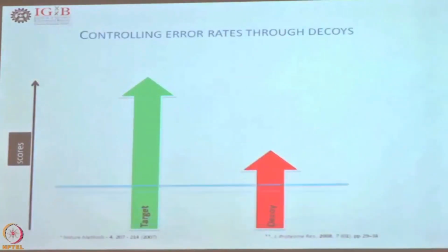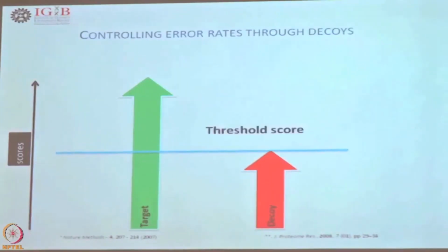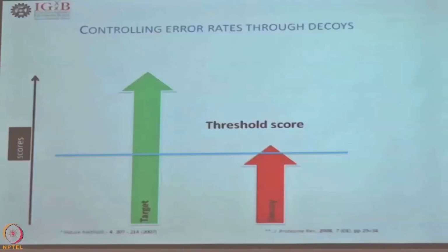And this I have already covered. So, this is 0% FDR: when no red is above this score, no red is there, but this is too purist an approach. So, what we generally do is reduce our bar in such a way that we allow a few reds and get some more greens into our search results, and that is how the PSMs are obtained, and from there the story begins. We get peptides, we match these peptides back to the proteins, and from these we infer which proteins are true for our experimental data.